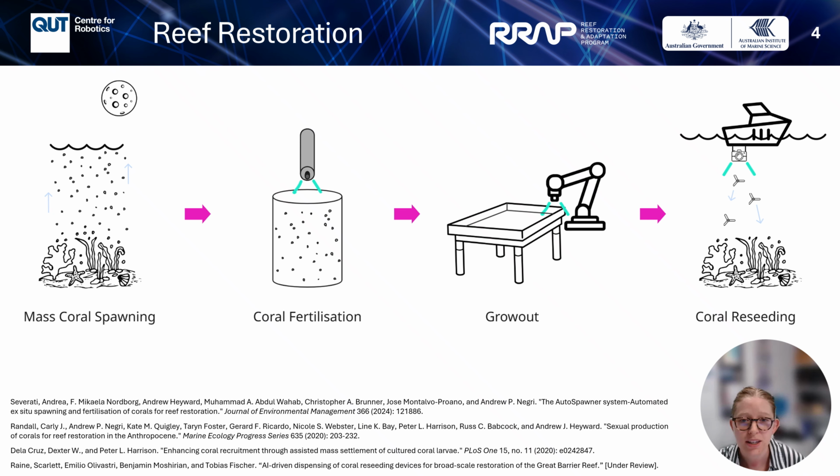In this work, we tackle the coral fertilization stage, where we develop the world's first automated monitoring camera system to track the coral spawn and optimize tank conditions.